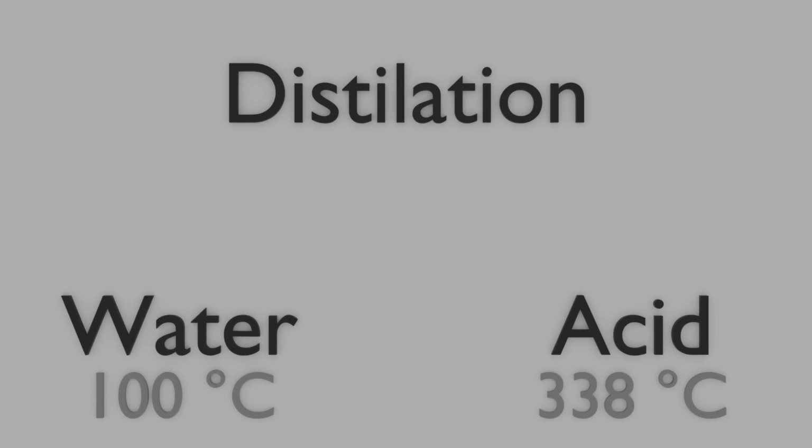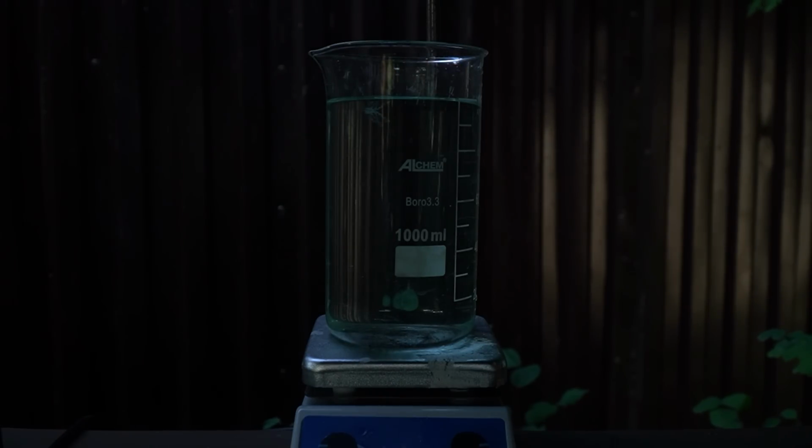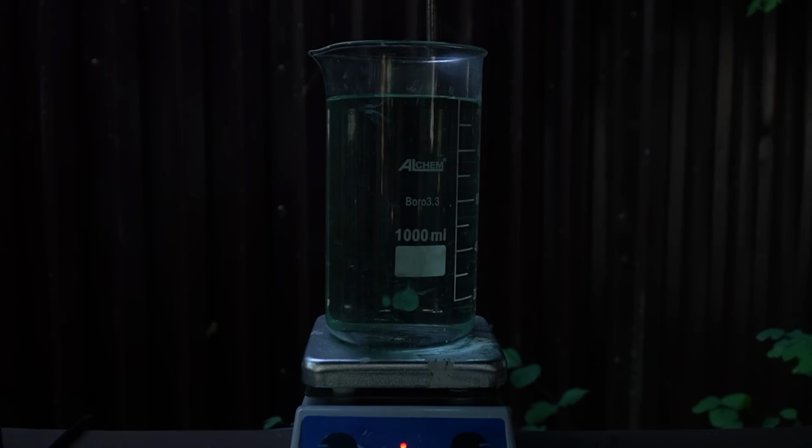If you've tried doing what I've done so far, it wouldn't actually work. That's because you need a much more concentrated acid, so how would we concentrate it? Well, that's easy. Sulfuric acid has a higher boiling point than water, so if we heat it up to the point where water starts boiling, the water will boil away and the acid will be left behind. Honestly, I could go more in depth and explain the differences between the intra and intermolecular interaction, but let's be honest, this is meant to be a silly practical video, so instead I'll just play this time lapse of me boiling it away.